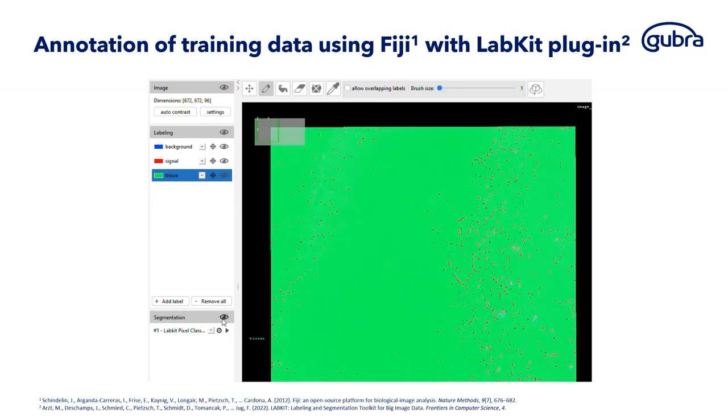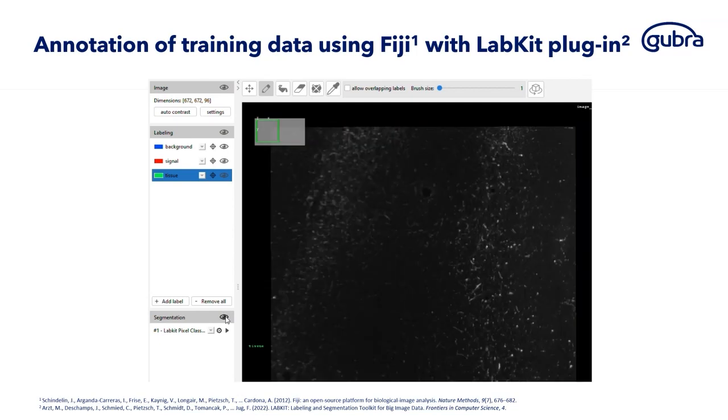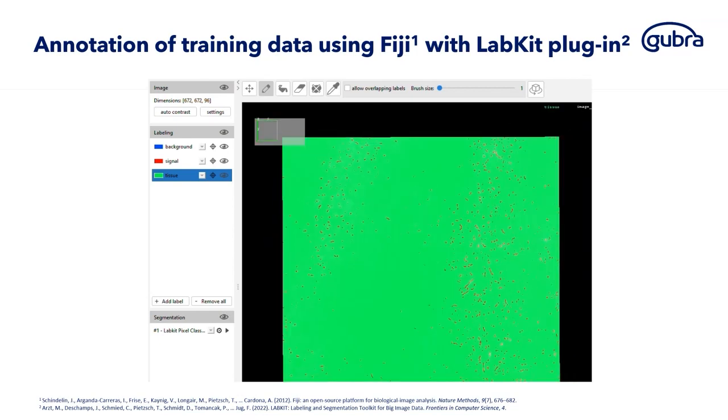And that's a very efficient approach. In the beginning, the prediction will not be perfect, so you can provide more examples. And after a few iterations, normally we are happy with the annotations. In general, if we are to annotate a volume of these 96 images, then normally providing examples of only 5 of these images is enough, and then you could say the rest of the annotations for free using this plugin.